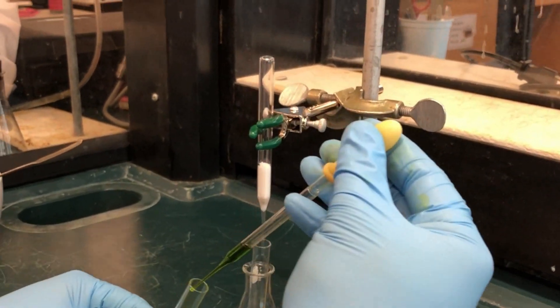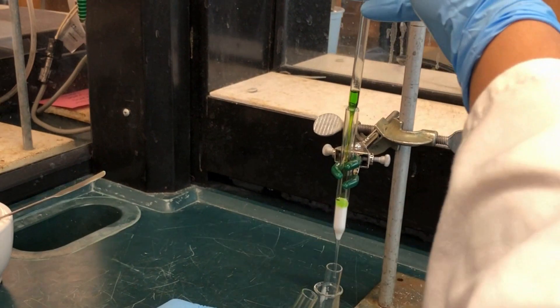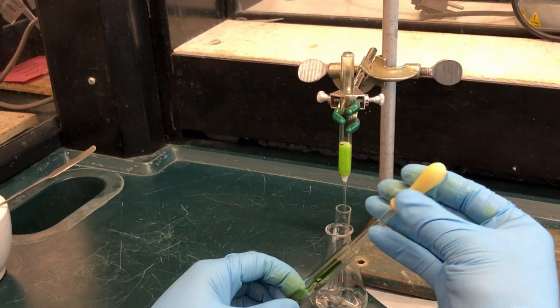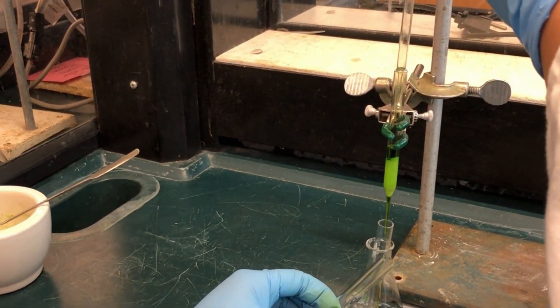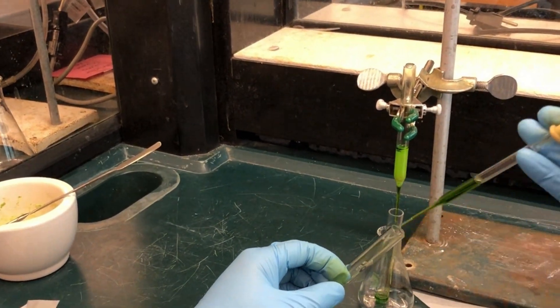Put a small test tube under the drying column. Carefully pipette the green petroleum ether layer into the top of the drying column and let it run through the sodium sulfate into the collection tube.